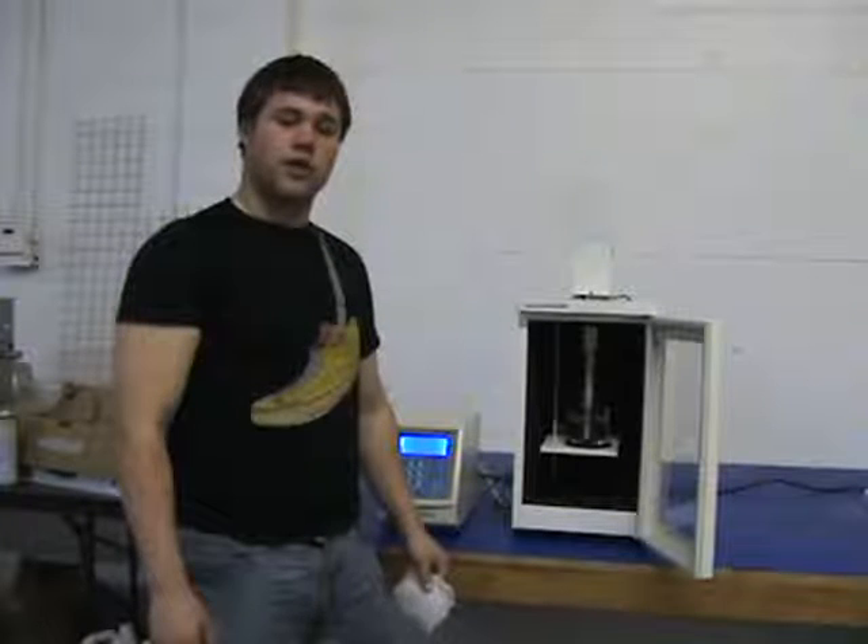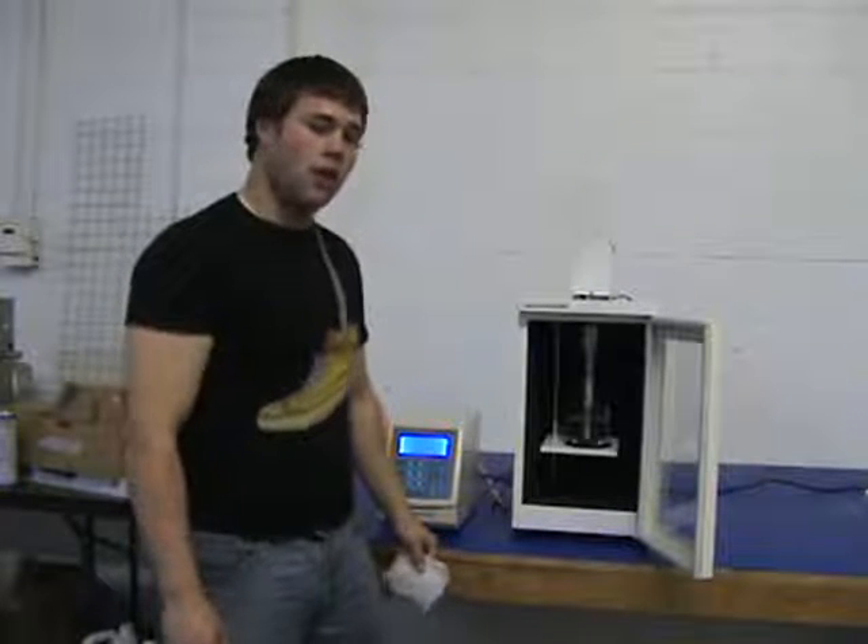Hi, I'm Tim with SharperTech Ultrasonics, and I'm here to demonstrate the ultrasonic cell disrupter and homogenizer.